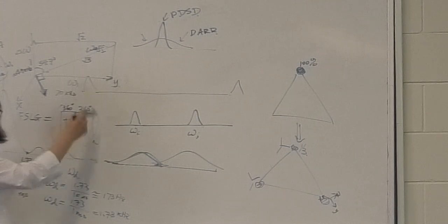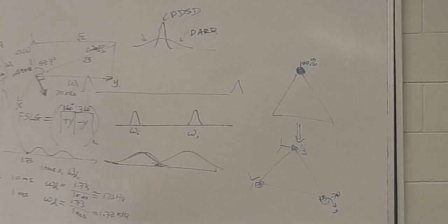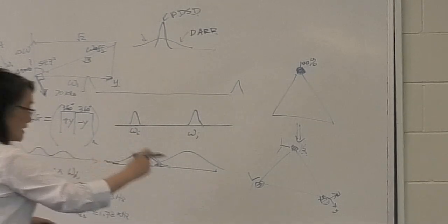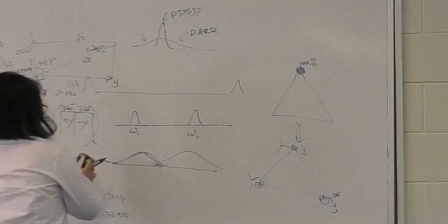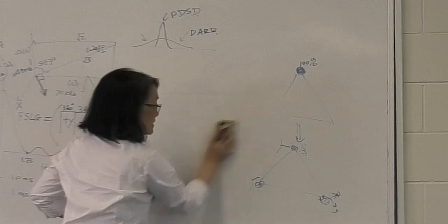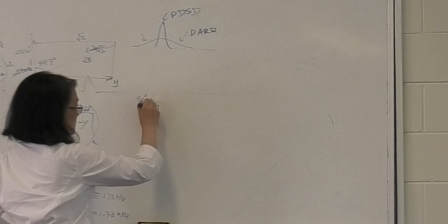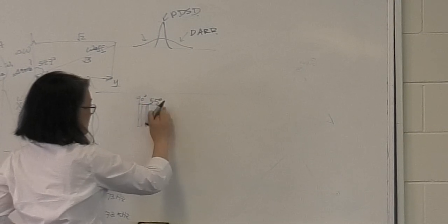It just keeps going. The 180-degree pulse direction also has to be chosen right in the context of FSLG. If my FSLG is in the y direction, this is not drawn very well, this should be narrower.